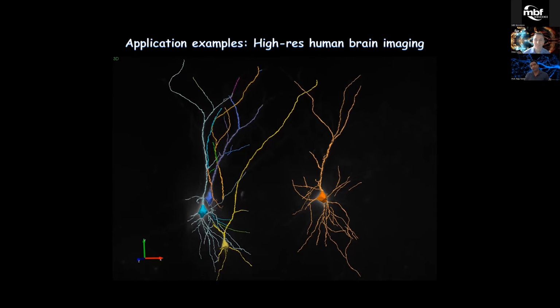So with the ClearScope or light sheet theta microscopy system, we can do that. If you use, let's say, confocal microscopy, it will take you ages to acquire that kind of data. With light sheet theta microscopy being a couple of orders of magnitude faster, these samples become accessible in a reasonable time frame.